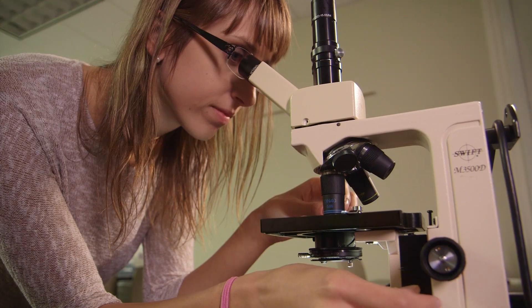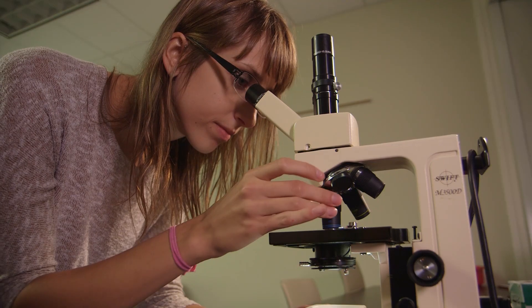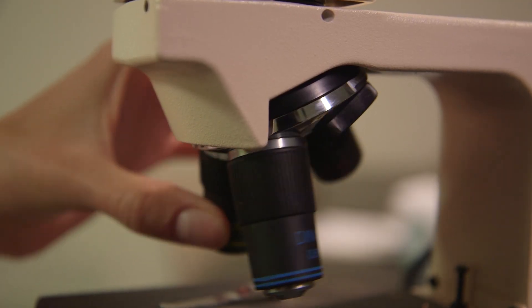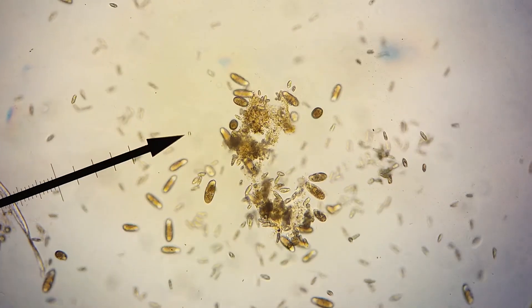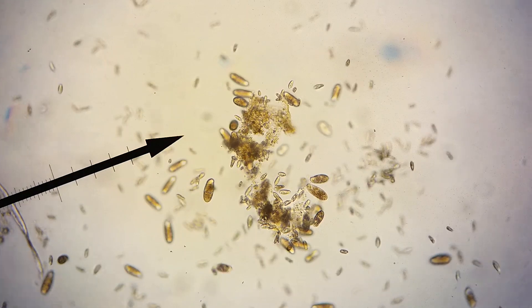When using the high power objective, you cannot use the coarse focus knob. If you cannot see your specimen, go back and focus it under low power. Once you switch to high power, you may have to adjust the light with the diaphragm lever since the high power objective lens has a smaller opening. You may need to focus continuously with the fine adjustment because live organisms tend to move not only from side to side, but also from top to bottom.